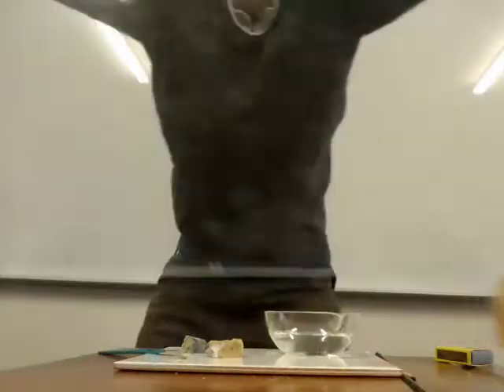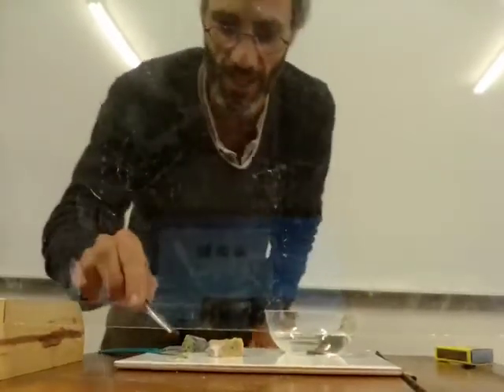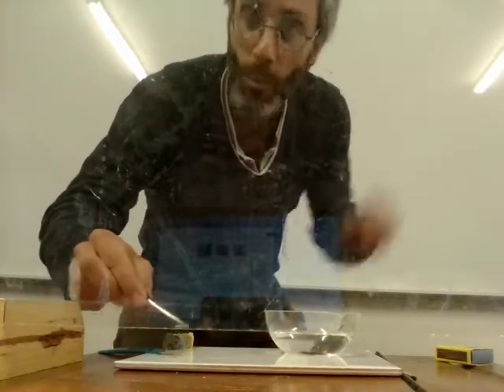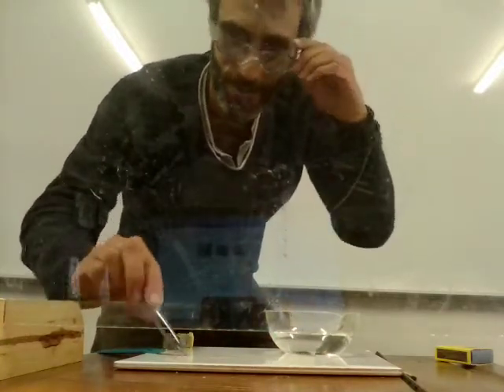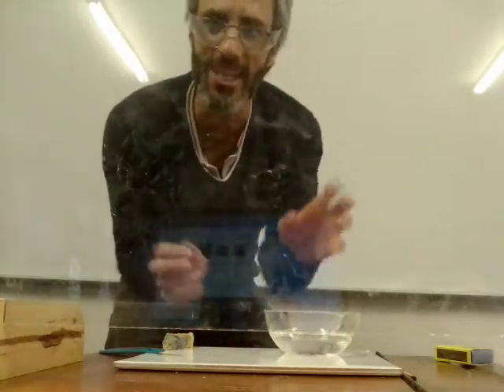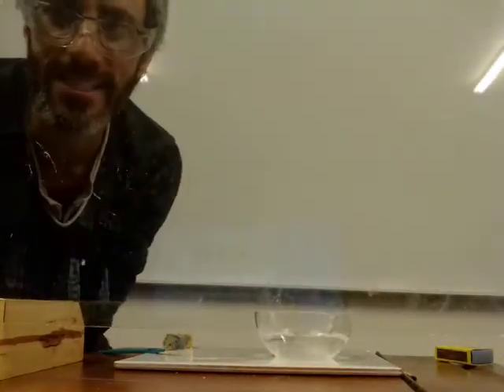Okay, now before I dip it into the water, I need to put the screen up, not to protect you, you guys are fine, but I just need to protect my computer. Okay, right. So here it goes. I'm going to just move these guys away. Put my goggles on. Here it goes. I don't know if you can see it sizzling. You can see a little bit of smoke. Okay. Probably not that easy to see. Maybe I'm going to bring it a bit closer like this.